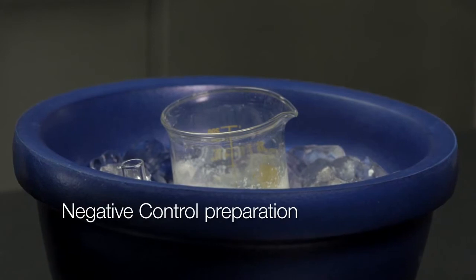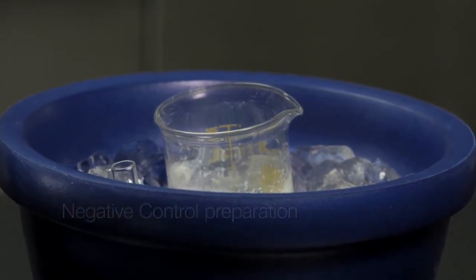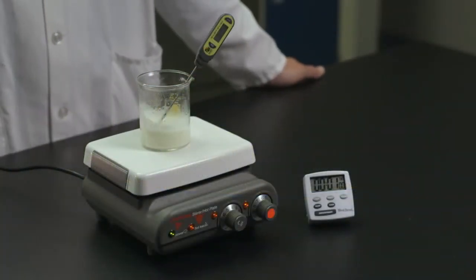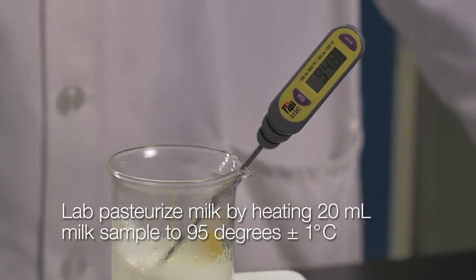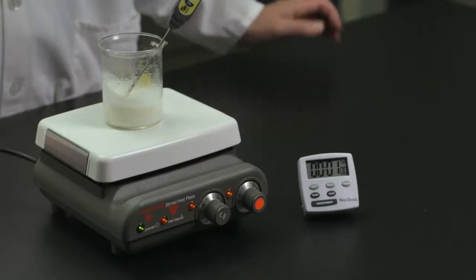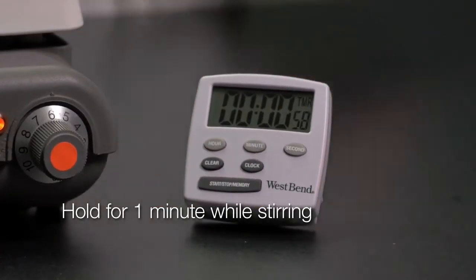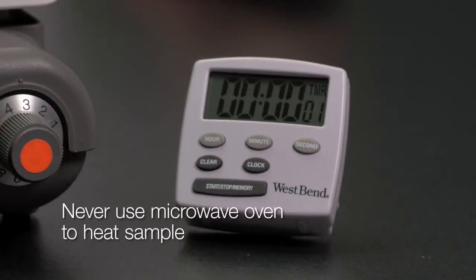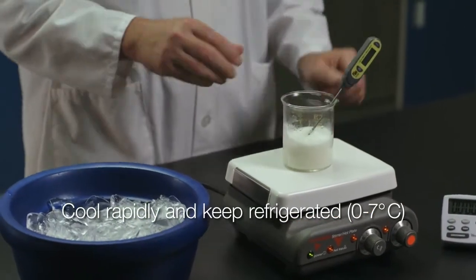To prepare a negative control, you can use a whole, homogenized milk sample pasteurized within the prior 48 hours, or you can pasteurize your own sample as we will now demonstrate. Heat at least 20 milliliters to 95 degrees Celsius, plus or minus 1 degree, and hold for 1 minute while stirring. Never use a microwave oven to heat the sample. Cool rapidly and keep the sample refrigerated.